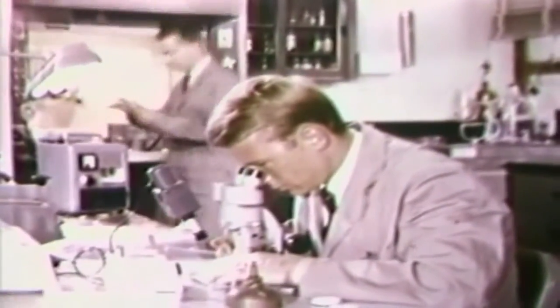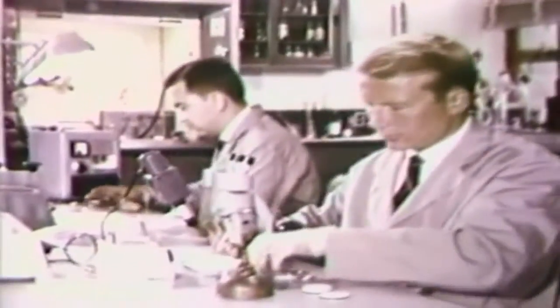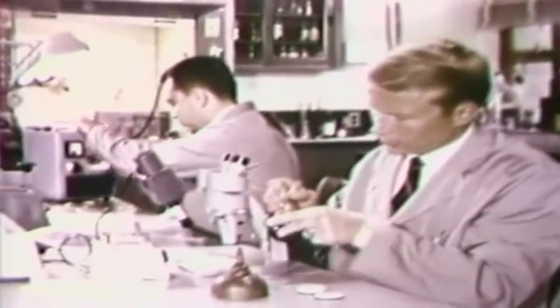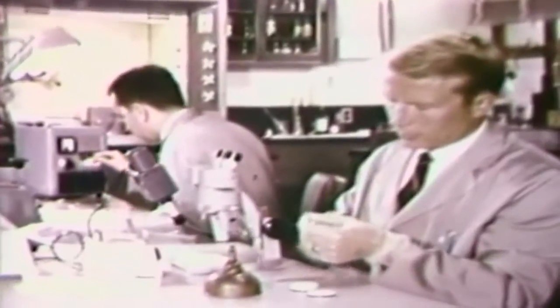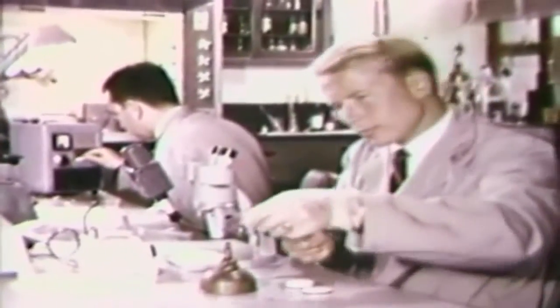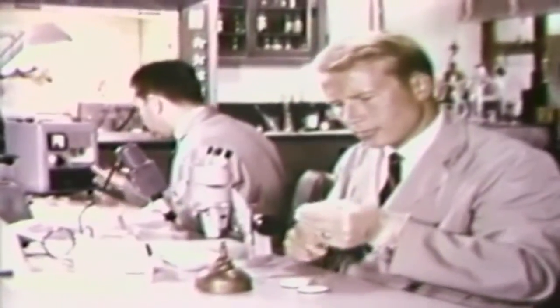Neutron activation analysis is the name given to a technique employed in the FBI laboratory to provide a sensitive and accurate method for the examination of physical evidence. The first step performed in this procedure is the preparation of samples for introduction into the nuclear reactor.